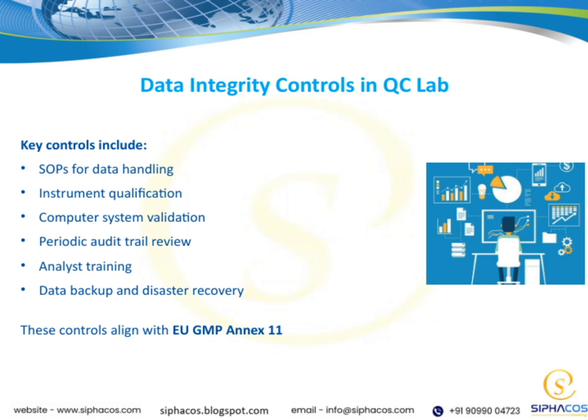All of these controls are aligned with the EU GMP Annex 11 guidelines, which set the standards for electronic records and signatures. Overall, these controls create a robust system that safeguards data integrity, supporting reliable quality control and regulatory compliance.